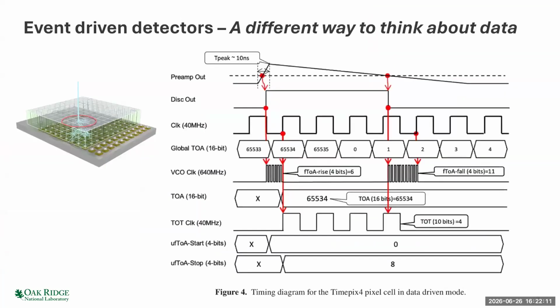So when I say the amount of data, it really is just data. It's not frames. So it's not like a conventional 4D camera where you just get many frames very quickly. You just get a list of events. And it turns out to get down to this few picosecond timing resolution, it's pretty difficult because if you think about it, just the time it takes for a clock pulse to propagate from one side of the chip to another, that's pretty significant at that picosecond timescale. And you start to get various sort of digital errors.